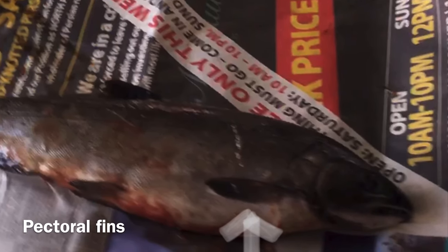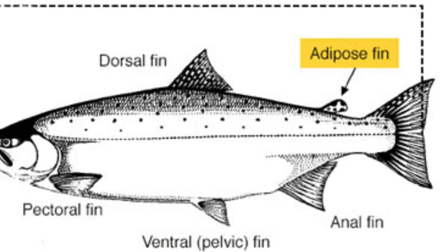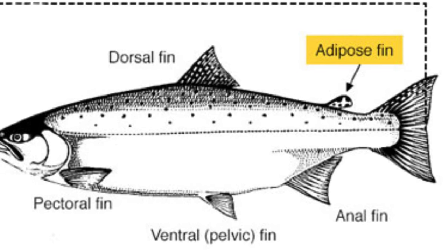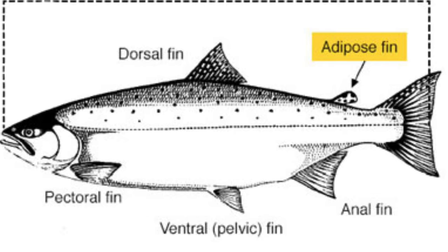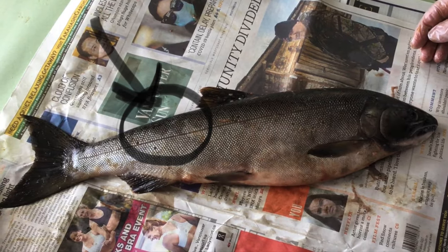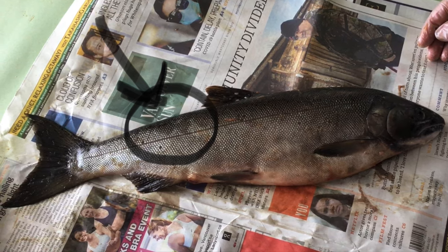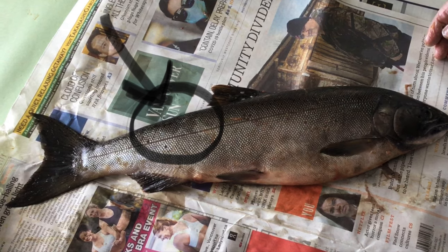arrow. The last fin is the adipose fin, which is located on the very dorsal back part of the salmon. It does not have a known job, and often it is removed from hatchery fish in order to identify them. Our fish is a hatchery fish. It does not have an adipose fin. Please take a moment to draw all the fins on your dissection recording sheet.